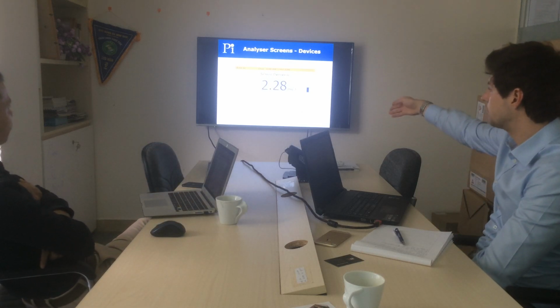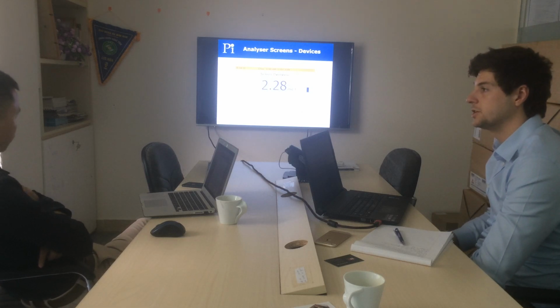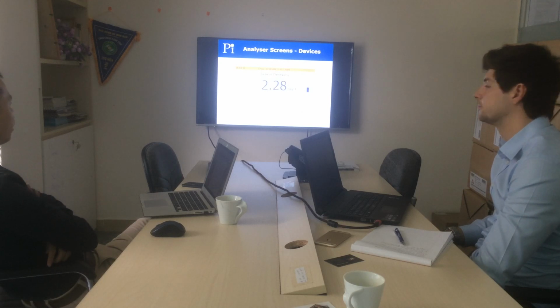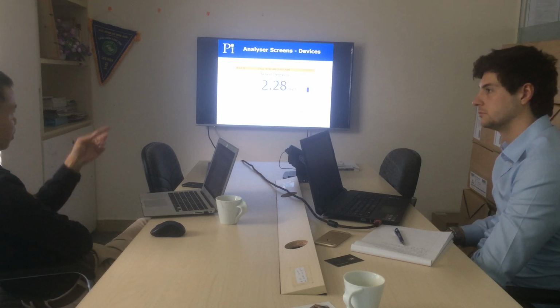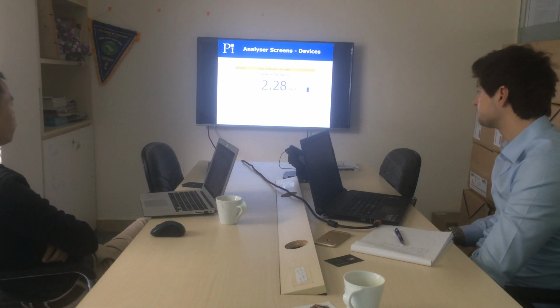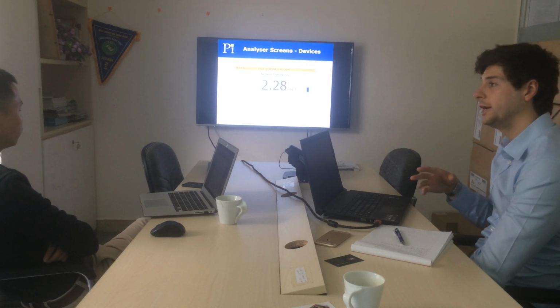Understood. So again, this gives you the range on the side, the readout, and the maintenance information. So this is very useful for users and engineers. I use several types of analyzer, but your product has more detail about the information. More detail. And also these we send out as default, but you can change them if you want to.